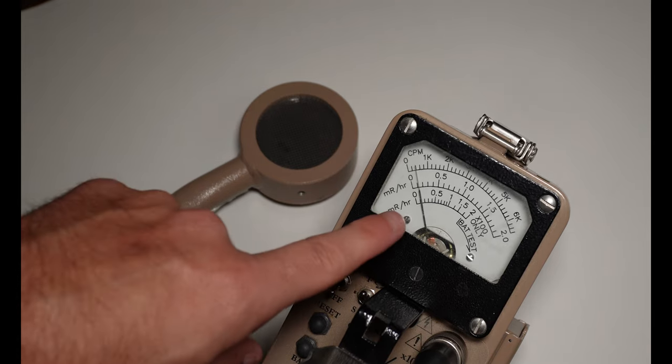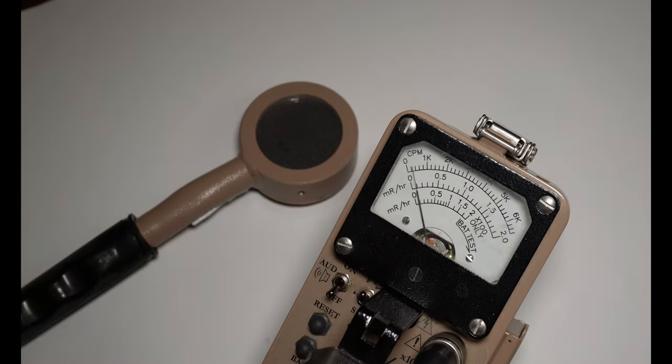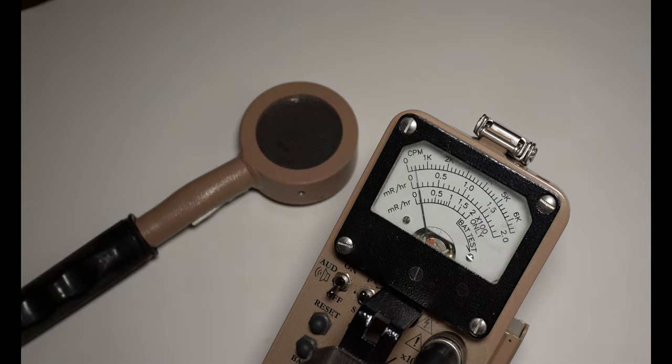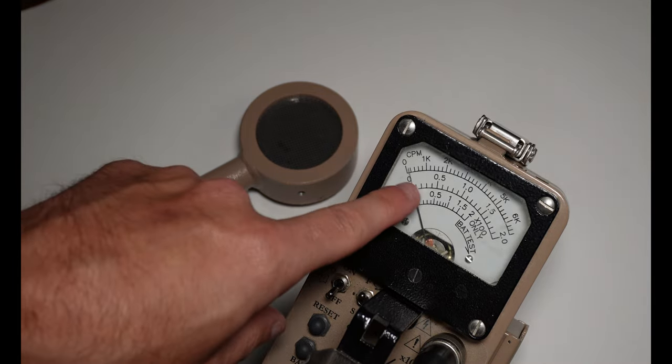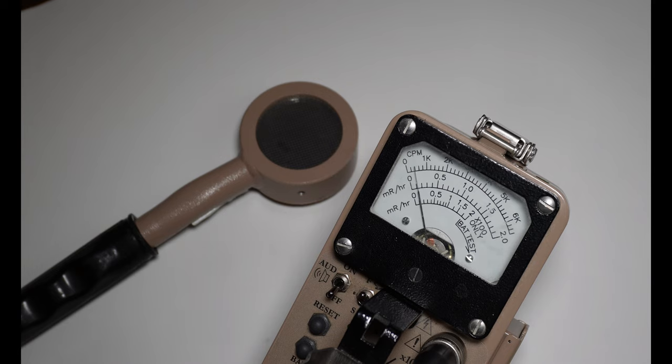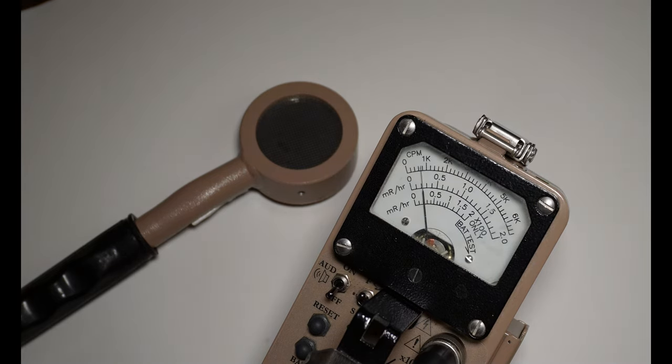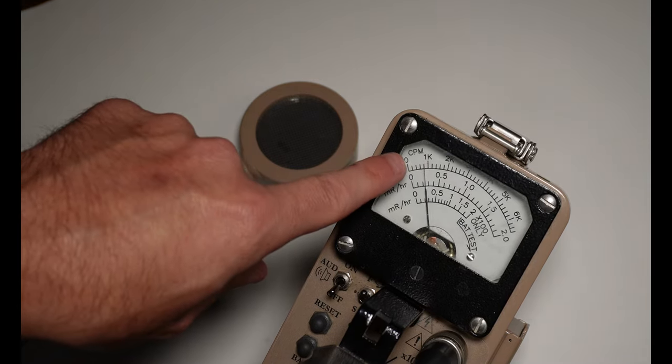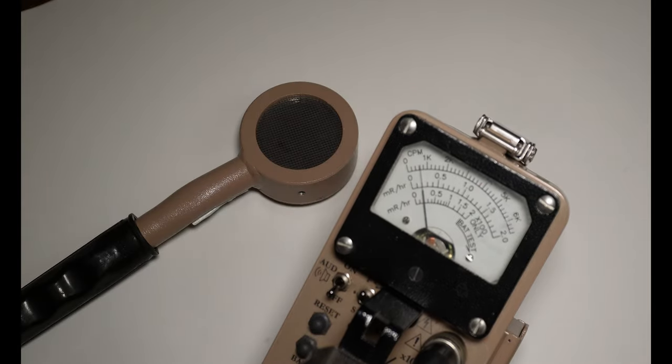So you'll note on the instrument that we have three different scales on the face of the survey meter. The first scale, or the bottom scale, is in MR per hour. The second scale, or the mid scale, the middle range, is also in MR per hour. And then the top one, that goes across the top, is in counts per minute.